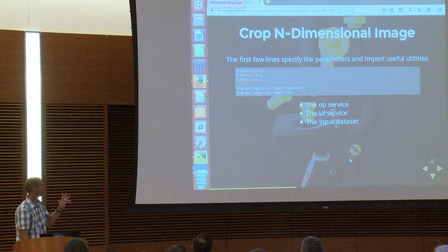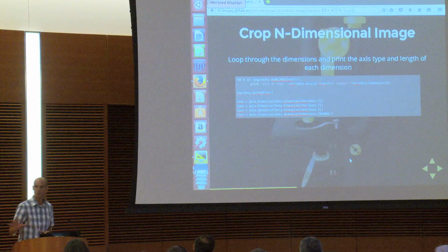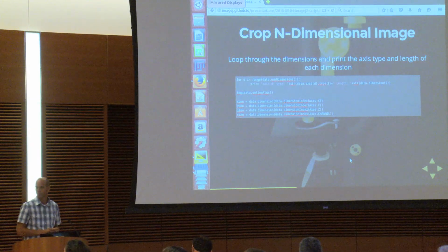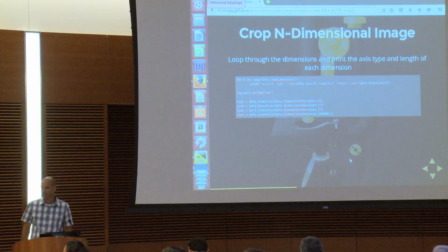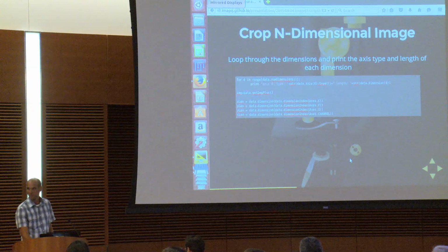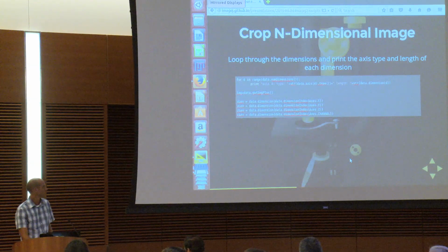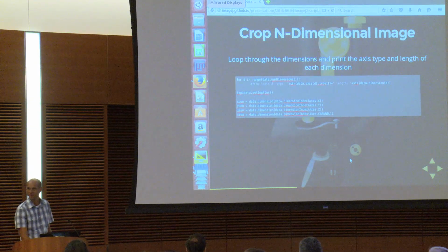So we have a parameter called data, and then from the data, IMG is the image that data contains. This is kind of an implementation detail, actually. When we first wrote this script, we used the data parameter. We didn't use IMG. So the data set is your image, okay? But there's a bug right now. The data set is actually wrapping another object called IMG plus. So the fact that we have to use IMG in some places is to work around that.